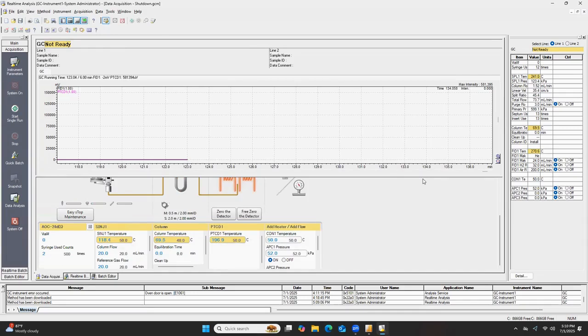So like I said, this could be anywhere from 30 minutes to an hour and a half. It just depends on how hot or how cold the lab is before everything reaches the appropriate temperature for us to actually power it down. It'll vary. And after that, we will turn off the instrument and then switch off the cylinder, right? Yes. Yeah.